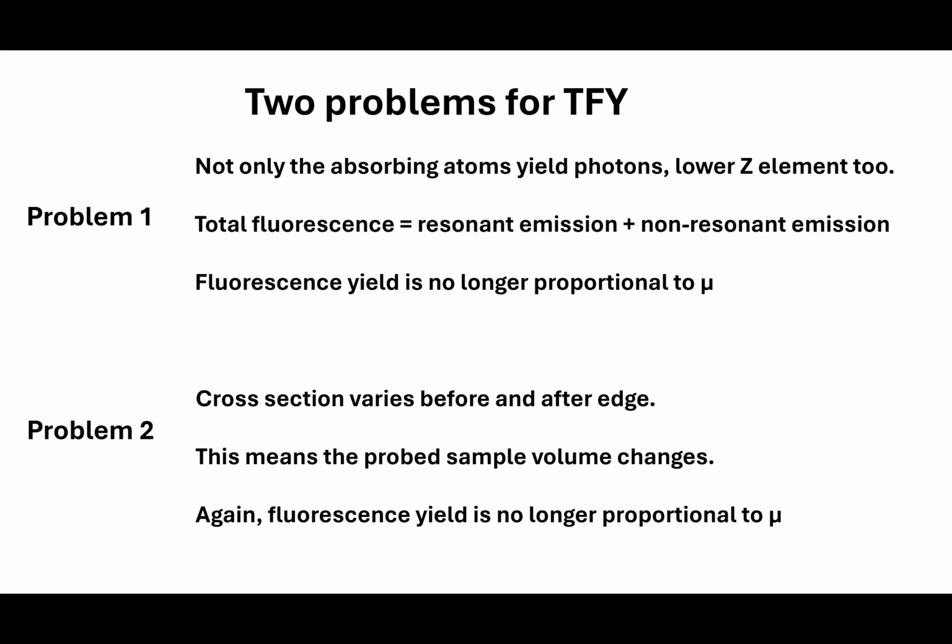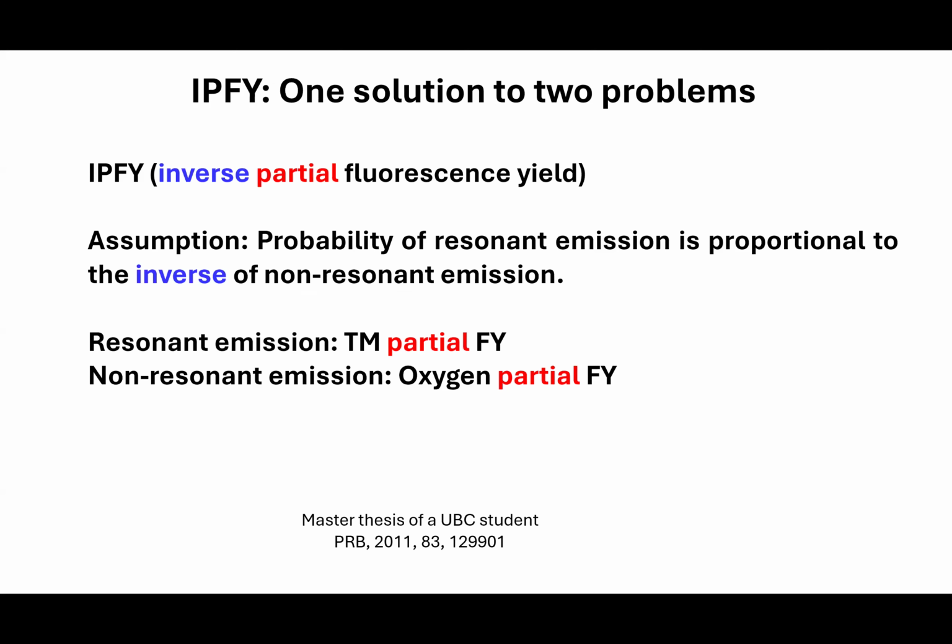Okay. So those are the two problems facing the total fluorescence yield, and the solution to that is IPFY, which is available at XAS.